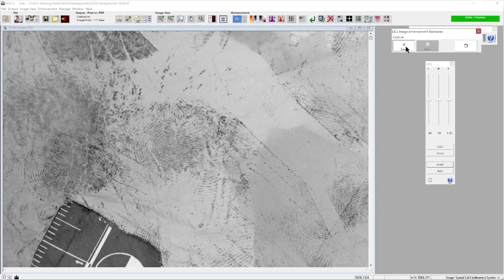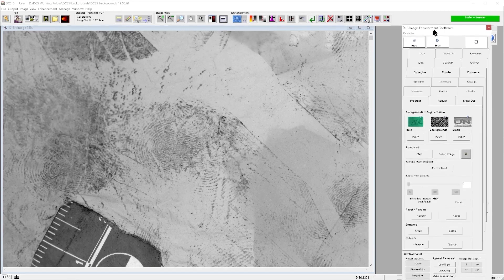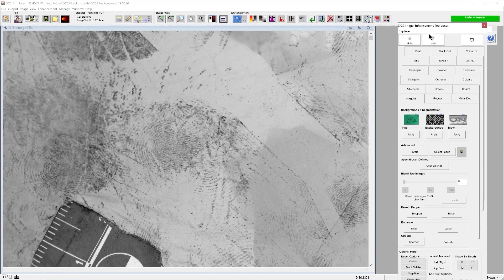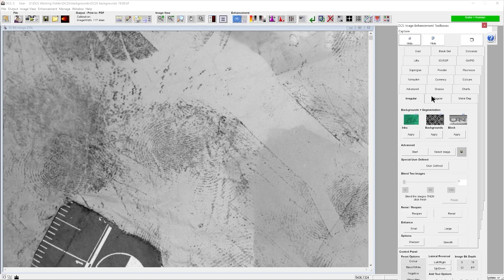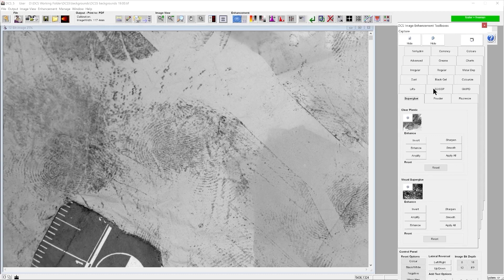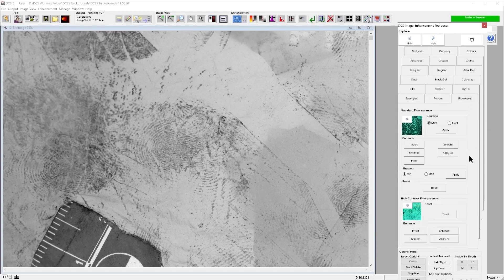And if we use the standard fluorescent tools in the software. Visual superglue, but we're going to look at fluorescence, which is here.